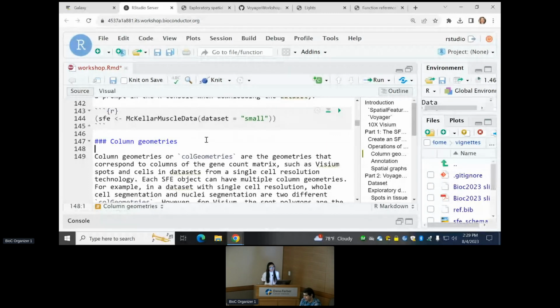It's implemented. The function should work, but rowGeometries might be used for transcript spots, like in smFISH-based data. However, often in MERFISH datasets from the Vizgen website, those are so large, like 30 gigabytes, that I'm not entirely sure what to do with this. As a result, I haven't really played around with it. But it's there. But here, because colGeometries are more often used, I'll do colGeometries here.